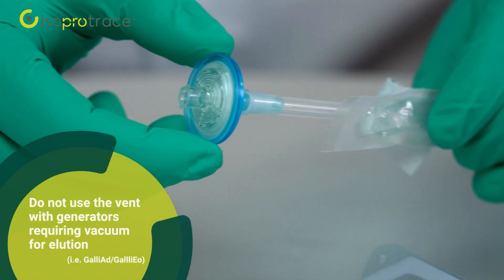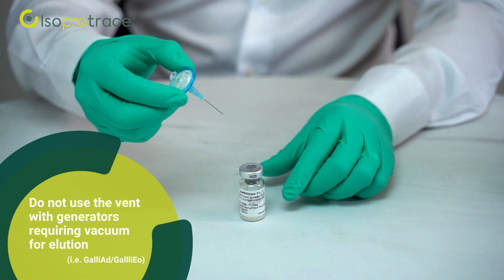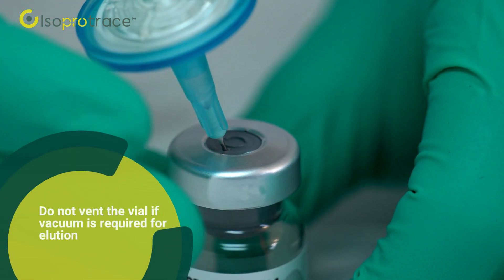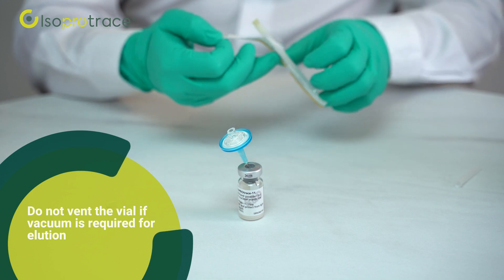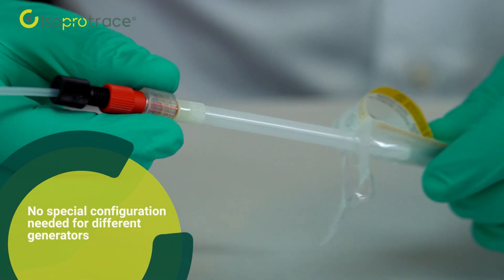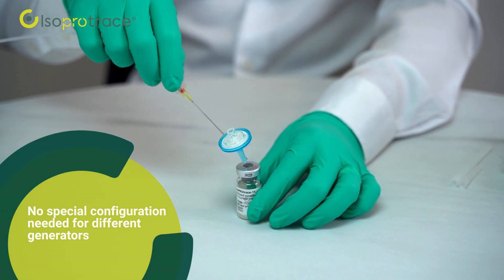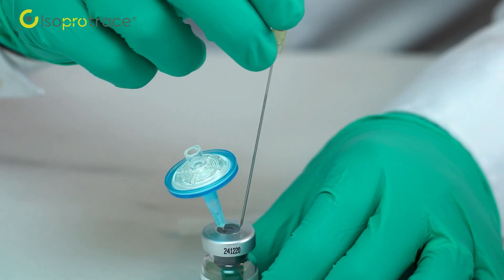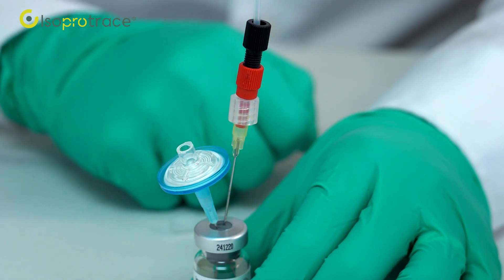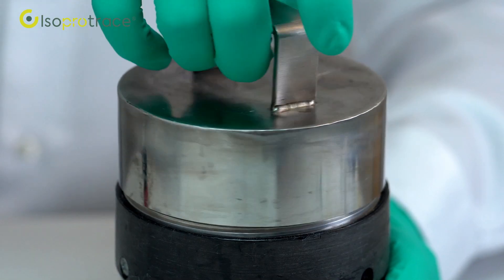Alternatively, a vented plastic spike can be used to connect the generator's outline in the next step. Do not vent the vial if vacuum is required for elution. Connect the generator's outline via connector to a non-metallic or coated sterile needle, or use a plastic spike. Insert the needle or plastic spike into the vial through the rubber stopper.